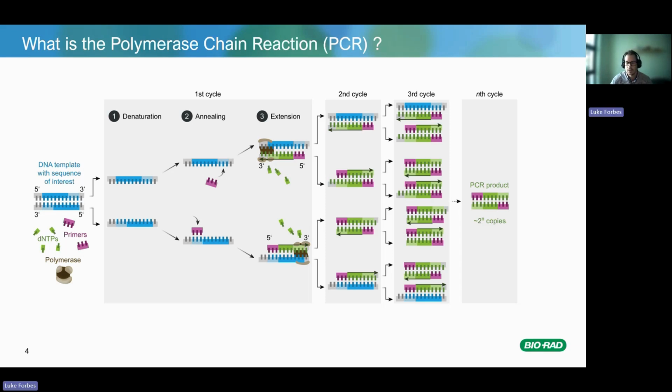And obviously, we know that PCR involves cycling at various temperatures, typically three main steps: the denaturation step, where the double-stranded DNA template is heated and breaks into two single strands. Then your annealing stage, where your reaction is cooled down to allow your primers to bind, which are complementary to your target DNA and flank the target sequence. And then the extension phase, in which the temperature is raised, and your DNA polymerase, your enzyme, extends the primers by adding complementary nucleotides, and this synthesizes a complementary strand.